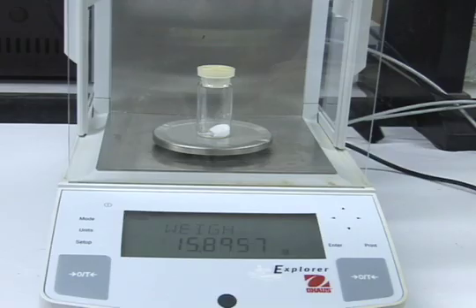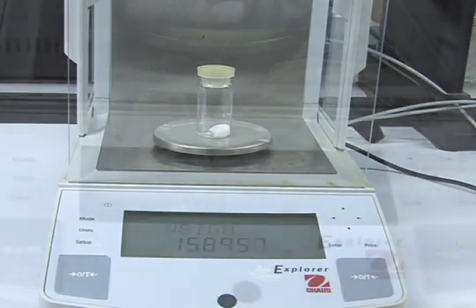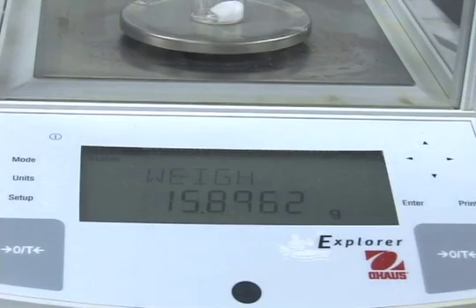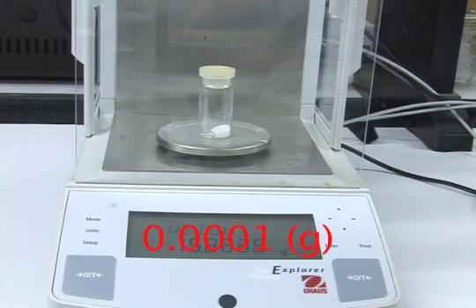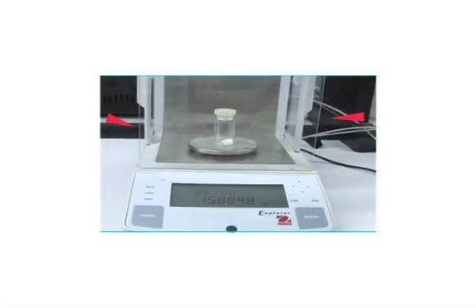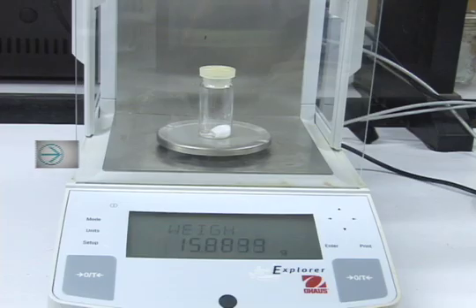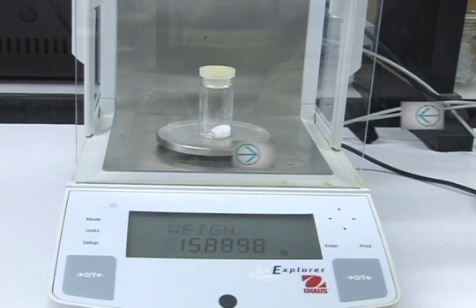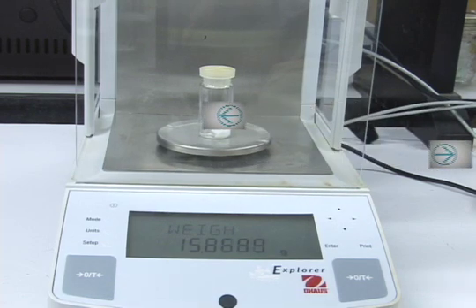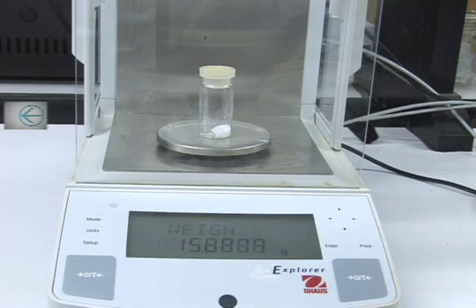When a more precise measure is required, we can use a balance. Balances are more sensitive and can be used to measure mass to the nearest 0.0001 grams. Notice that the balance pans are enclosed with a glass case. This is to prevent airflow around the balance or scale, which may interfere with your measurement.